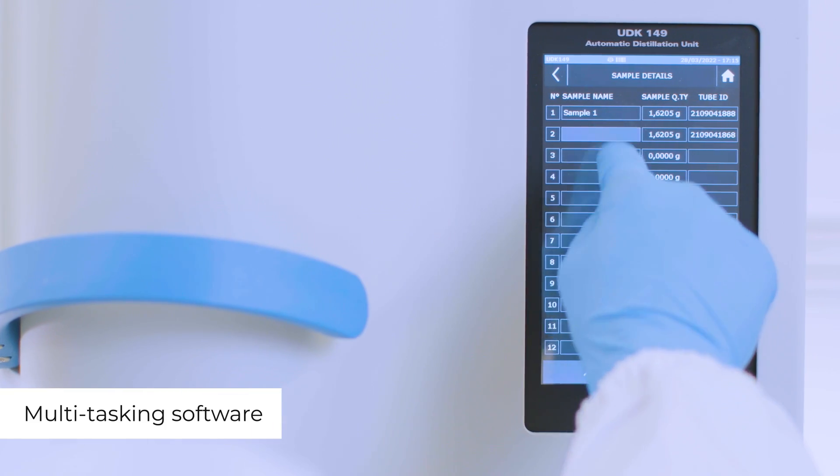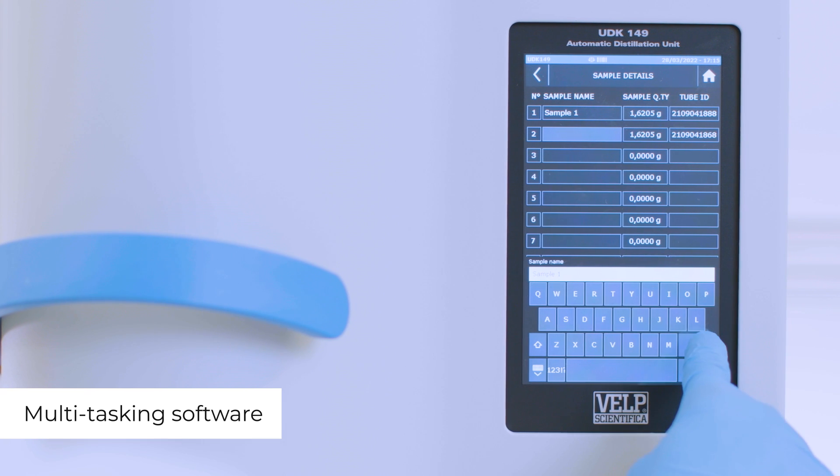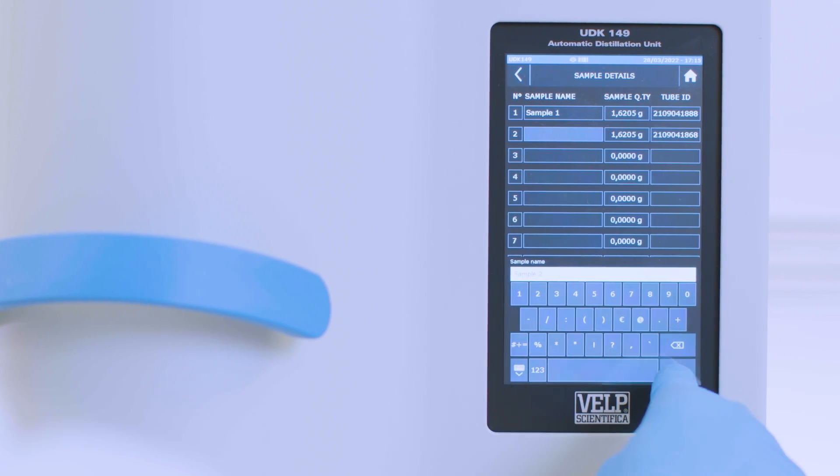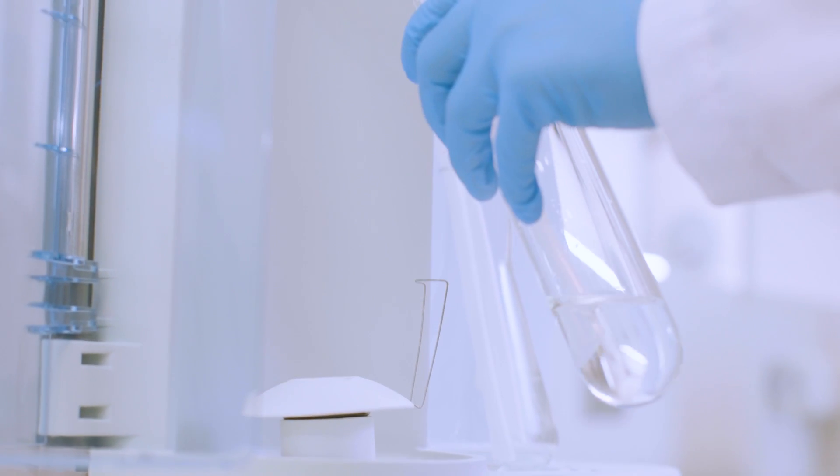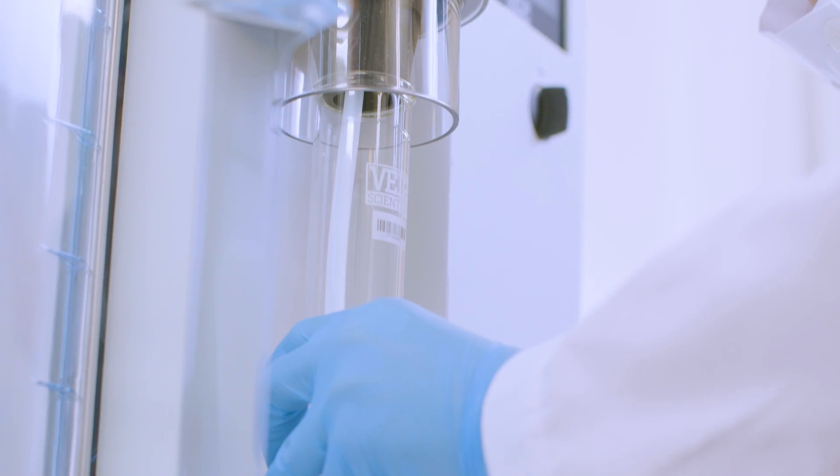The multitasking software allows the user to set up a series of analyses, saving valuable time. The comfortable lever guides the operator to load the test tube into the correct position.